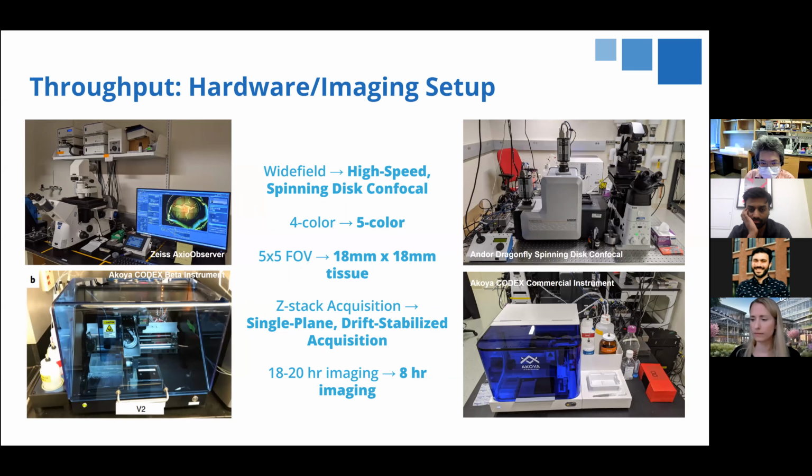One big point with multiplexed imaging is throughput. Both CYCIF and CODEX are relatively high throughput, but with something like CODEX, there are some limiting factors.